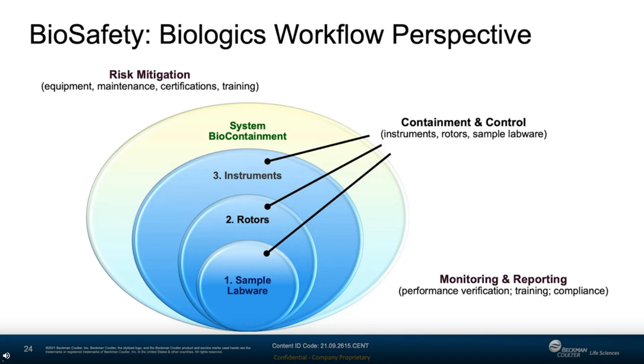If you work in labs long enough, there's a chance that you're going to witness or hear of centrifugation incidents. I've described a couple of them already. In my experience, nearly all of them were due to human error. Also, in my experience, in none of them was anybody injured. And that's really a testament to the centrifugation industry, and part of why I think centrifuge safety isn't really front of mind. But losing a centrifuge, you're going to lose your sample, it's going to stop work in the laboratory, and it's a very expensive incident. So we should all be aiming for 100% centrifuge safety all the time.